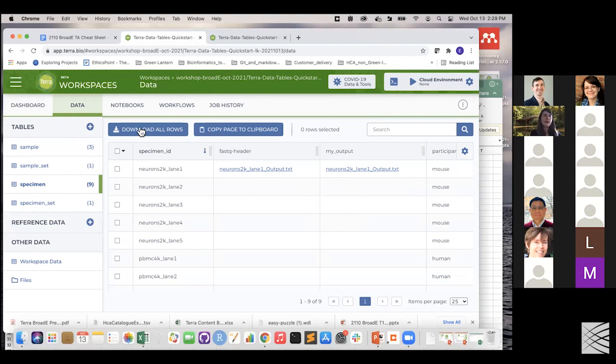All right. So let's talk about now that second use case I mentioned about running sets. Right now, we've been using our entity data tables as a root entity. And it might be the case that we want to take in 3 subsets of a larger sample and output 1 single file. So for example, here in the specimen table, you see that we have multiple lanes of sequencing. Maybe we want to write just 1 output file back from using these 3 different lanes of sequencing as input.